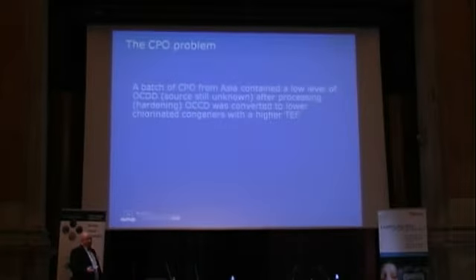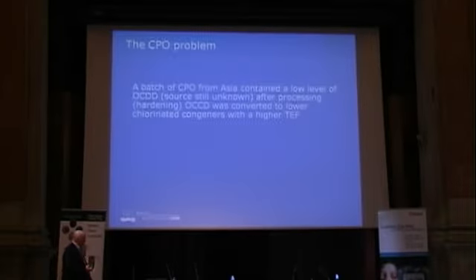They imported palm oil from Asia, and it was controlled. It was checked in some laboratory, and they analyzed it, and they found that there was a very low amount of OCDD, approximately 200 picogram, resulting in a very, very low level on TEQ basis.